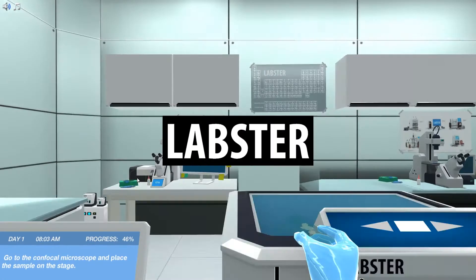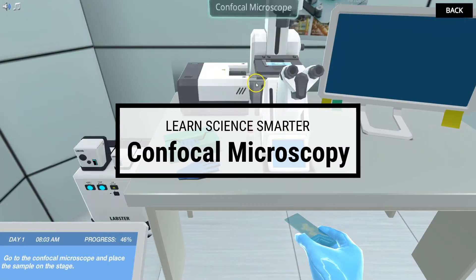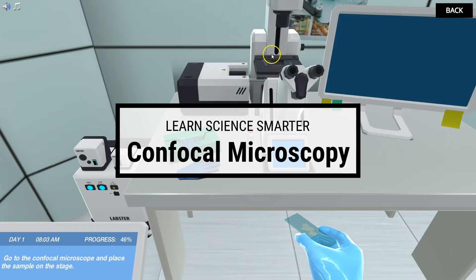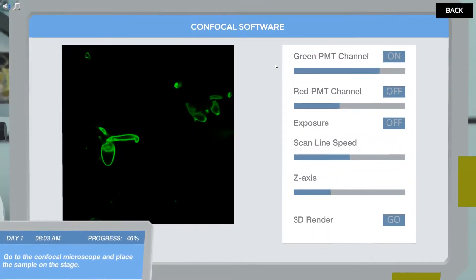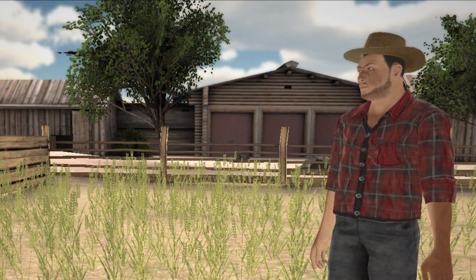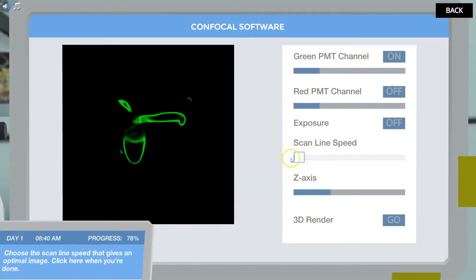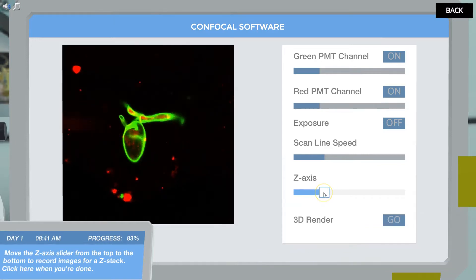In this simulation, you are trained in how to take pin-sharp micrographs and detailed 3D renderings to save your uncle's crop from a mysterious plant disease. You will learn about the benefits of using a laser scanning confocal microscope and have a closer look inside it.